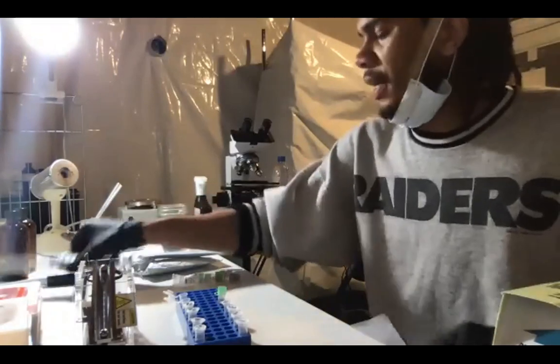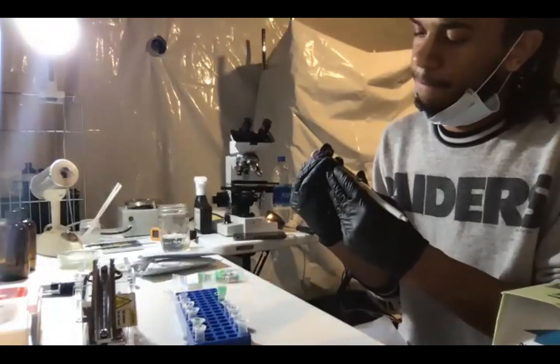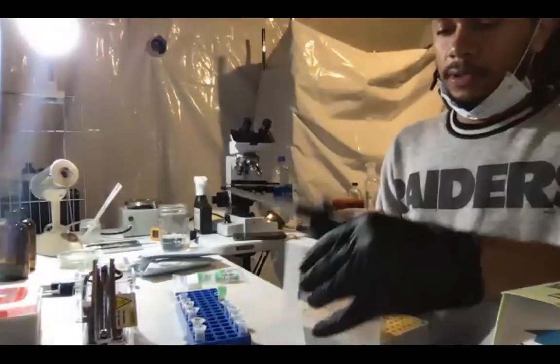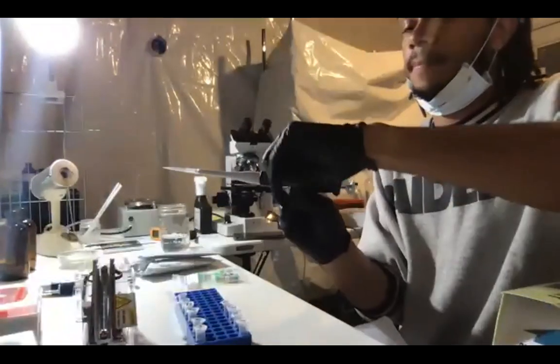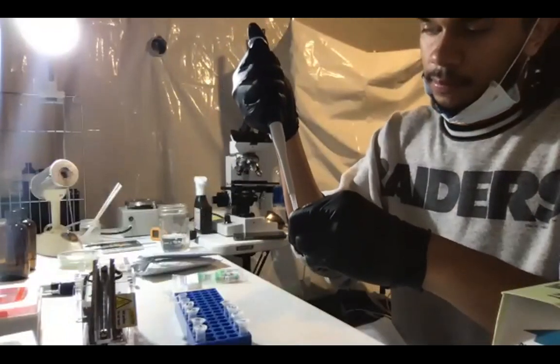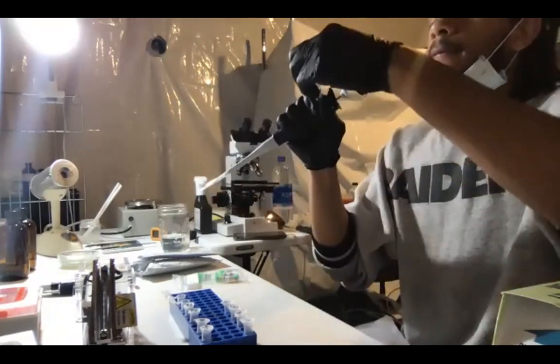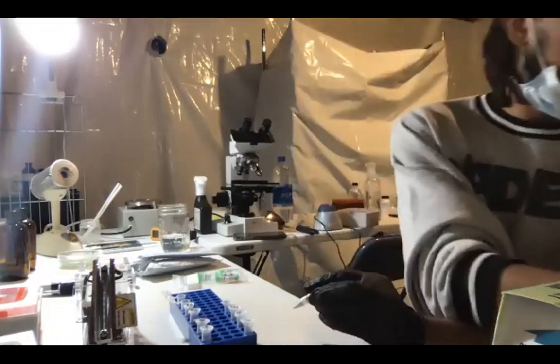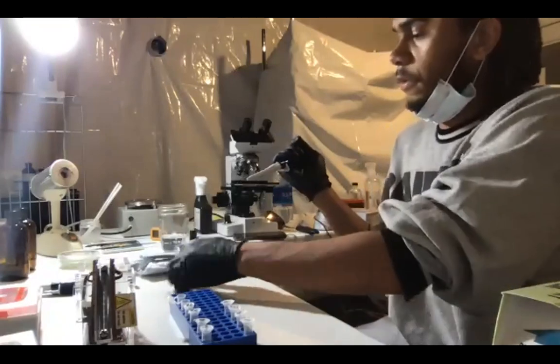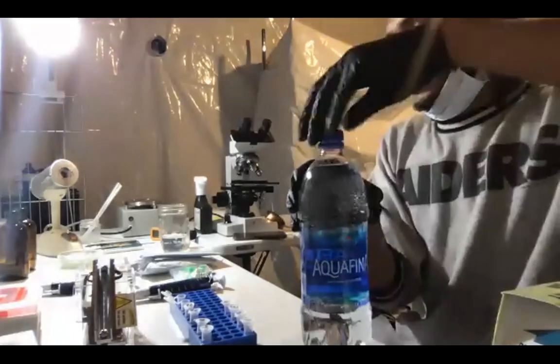So I need 100 microliters of master mix for each. That's for an 8 sample reaction. I really could use 50, but I like to go a little heavy handed. I'll attach my pipette tip and put 100 microliters in each. But if you're really concerned about how much you're spending on this, just do the exact amount. So again, like I mentioned, you only need 50 per 4 reactions. Now I added that, and I'm going to add 76 microliters of water into each of those.